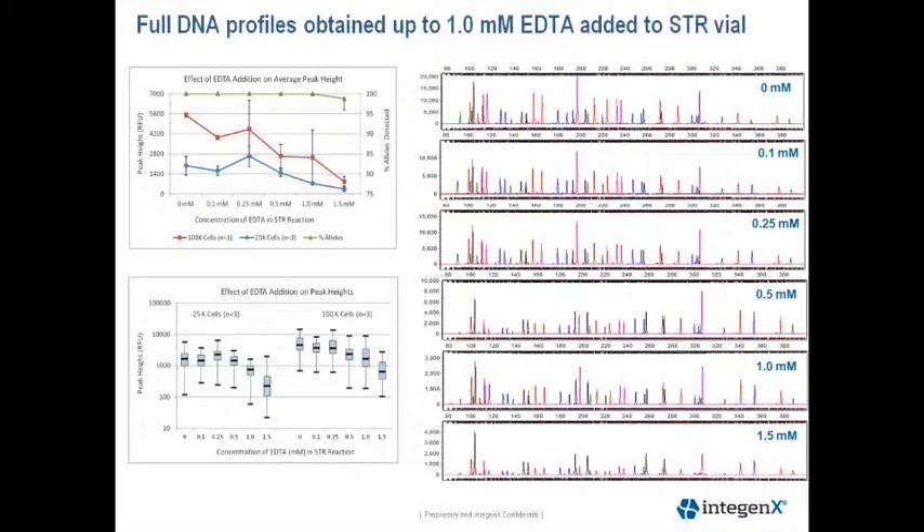The upper left-hand corner shows a graph with the average peak heights plus or minus the standard deviation, and the percentage of alleles detected for each EDTA concentration. As you can see, the percentage of average peak heights are decreasing with increasing EDTA concentration, which is expected as magnesium chloride concentration is decreased in a PCR reaction. The lower left-hand graph is a box plot of the peak heights showing the same trend, broken out by cell load of 25,000 and 100,000 cells.